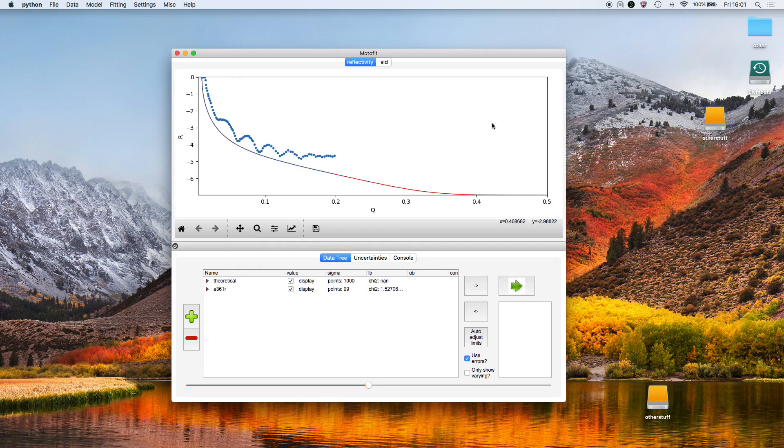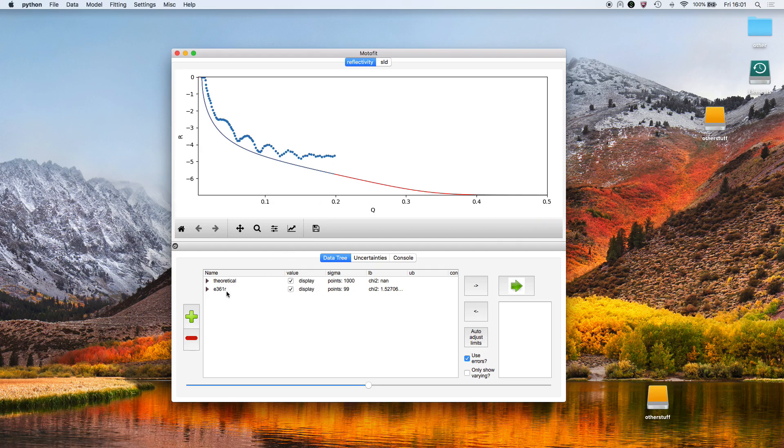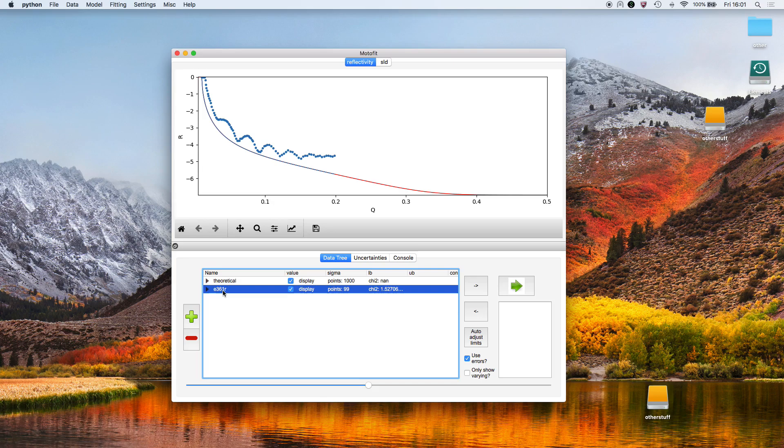This dataset was recorded a while ago, so the background is very high. After loading the dataset, it's visible in the data tree. If I expand the data tree, we can see that there's a model generated.